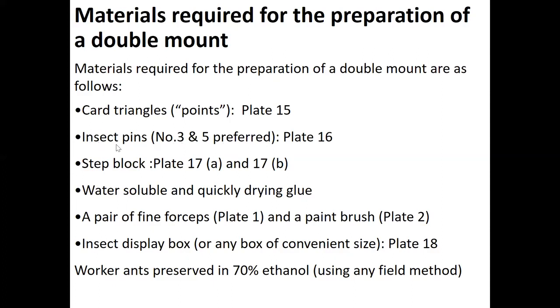Insect pins, number 3 and 5 preferred. I don't think we in Sri Lanka have a place to purchase these insect pins directly. But these are not normal pins, because normal pins get rust after some time, but these insect pins do not. There are numbers according to the width and the length of the pin. Insect pins number 3 and 5 preferred.